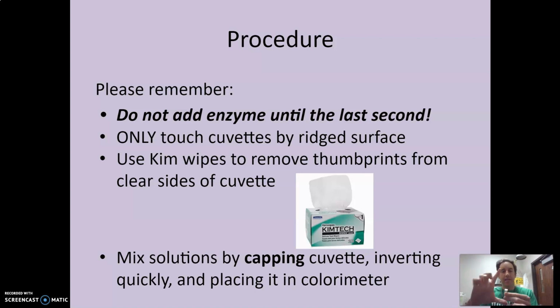And then finally, you're going to cap the cuvette, put that cover on, and then you're going to invert your solution to mix it up, okay? So your cuvettes are ready to go. They're clean. You're only handling them by the ridge surfaces.